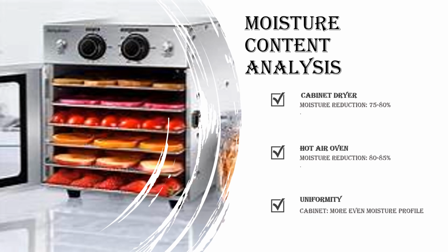Moisture content analysis. For moisture analysis, for cabinet, the reduction will be around 75 to 80%, whereas in oven, the reduction will be around 80 to 85%. When we see the uniformity, cabinet has a more even moisture profile. Even though the moisture reduction in oven is higher when compared to the cabinet dryer, the uniformity is not that good for the oven when compared to cabinet, because the cabinet dryer dries the product in a uniform manner, so the product's uniformity is good.